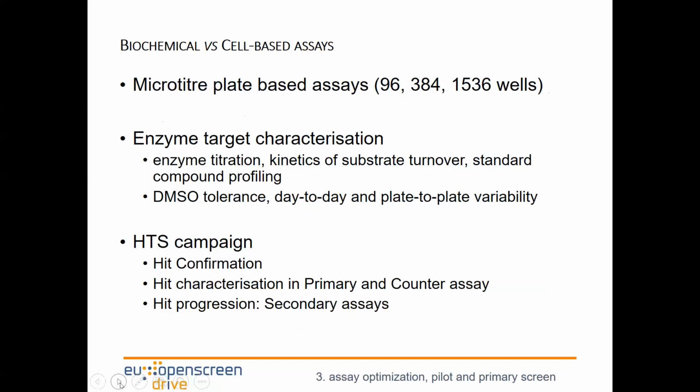The advantage of biochemical assays is that, as you have the purified target in isolation, we know the absolute concentration of the target. We can dose in substrate at a particular concentration. We can actually do kinetics of substrate turnover and do quantitative studies, including potency determination of compounds.